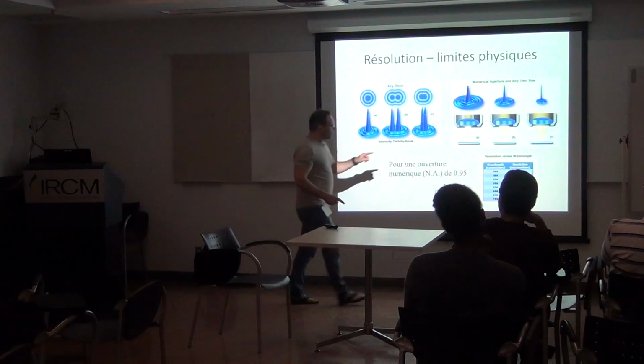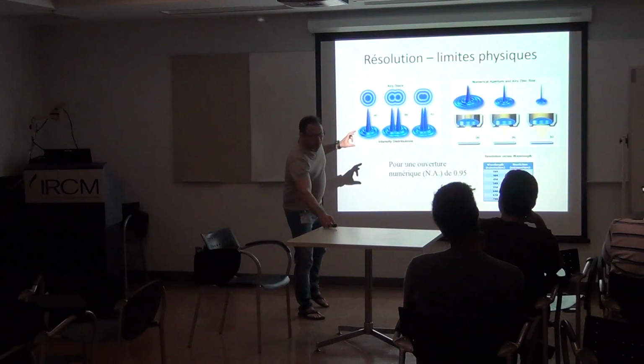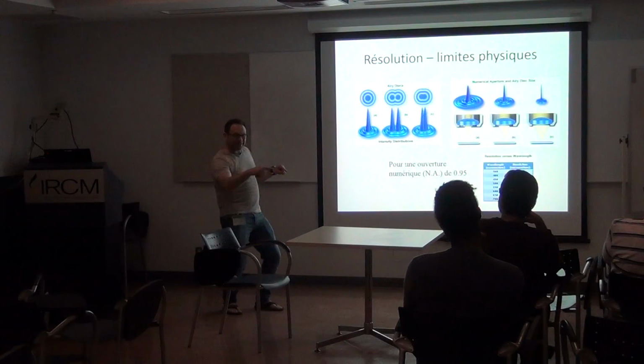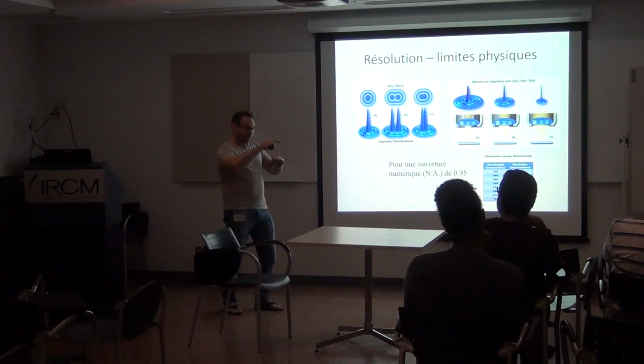So the focus is always at a certain distance from the lens, and this will also define what we call the working distance. You remember when I said, will I be able to put my finger in between this? That's what we define as the working distance: the space between the surface of the objective and the place where the real focus is.